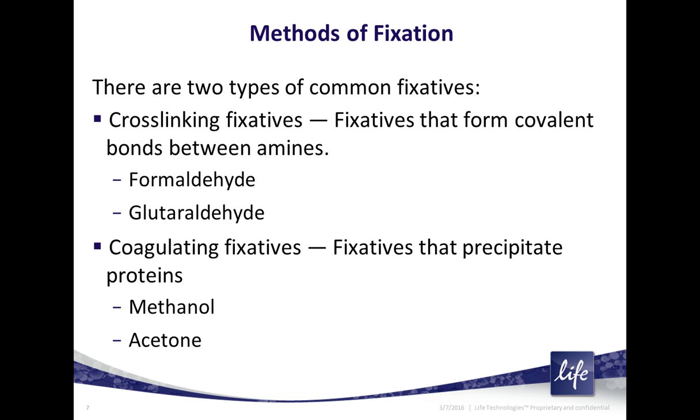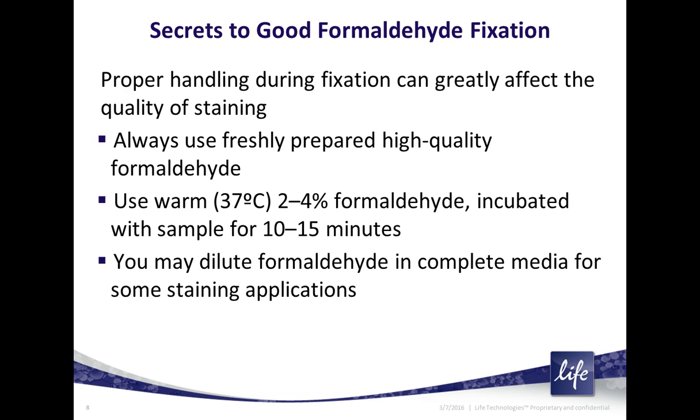Now, other fixatives include methanol, which I misspelled there, sorry, and acetone. Now, let's go to the next slide here. I think I addressed those.